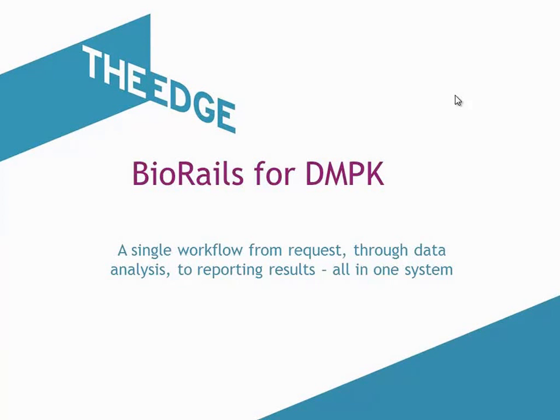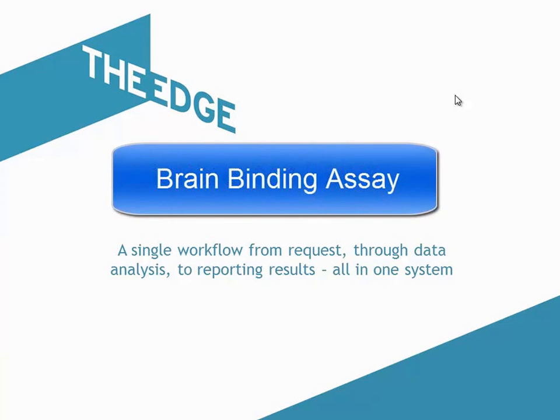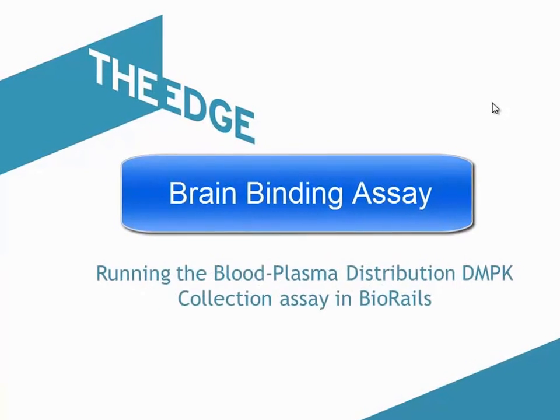BioRails for DMPK, a single workflow from request through data analysis to reporting results, all in one system. This is a demonstration of a brain binding assay using BioRails.